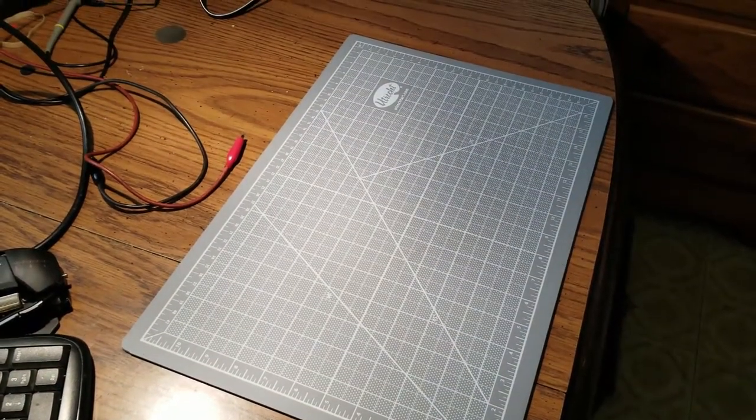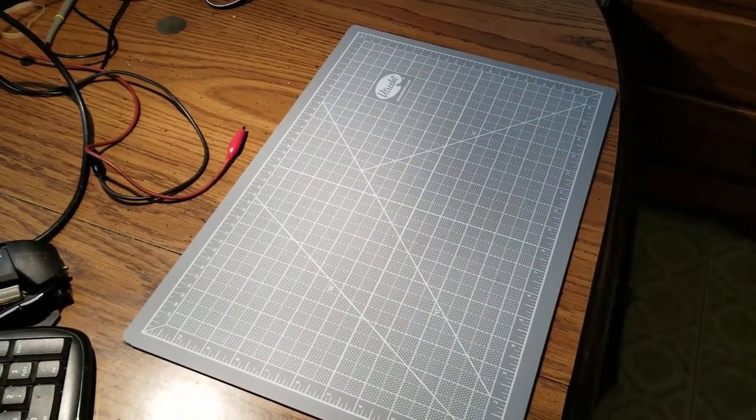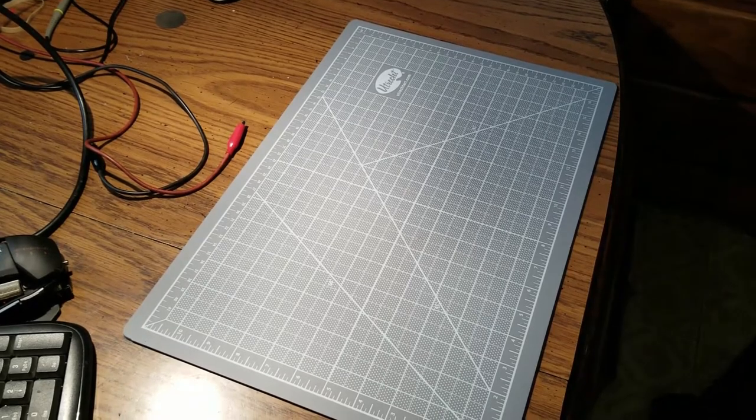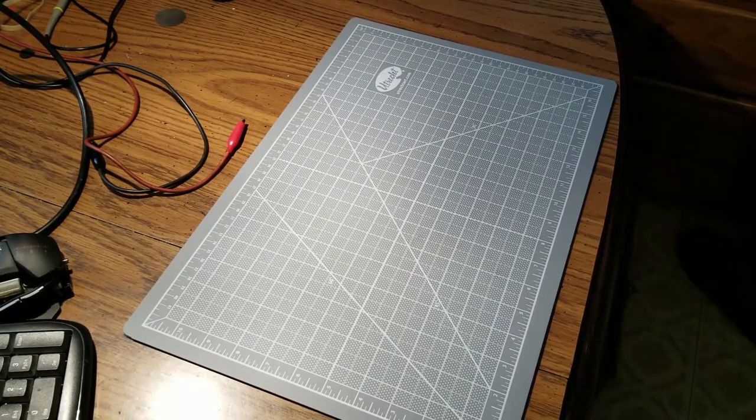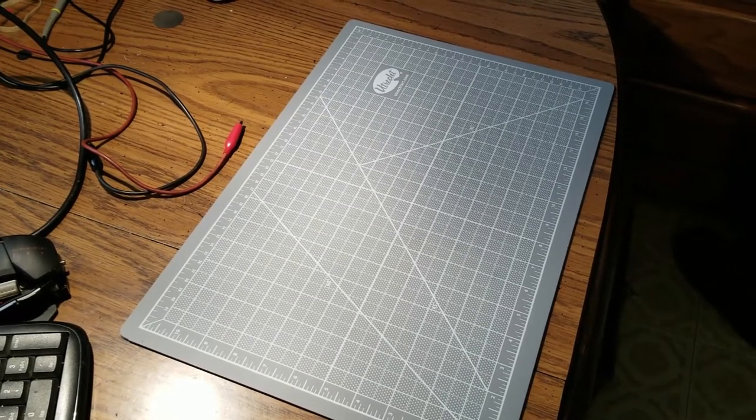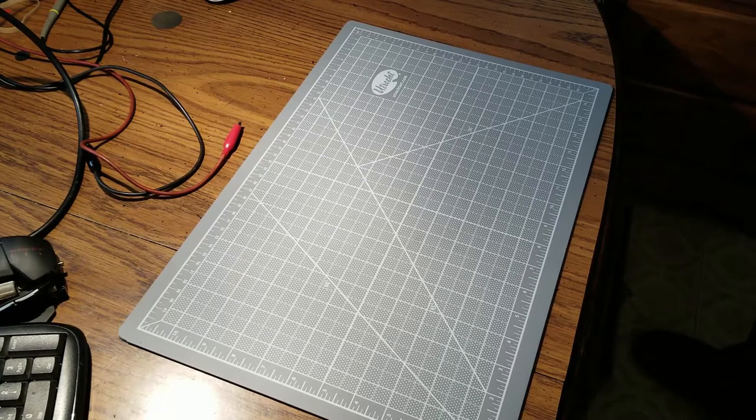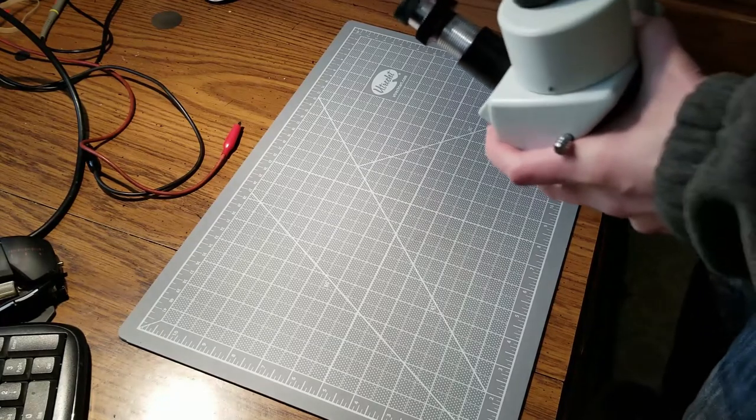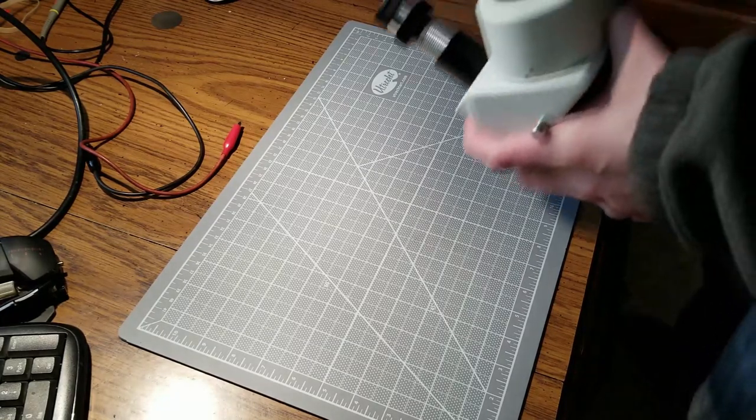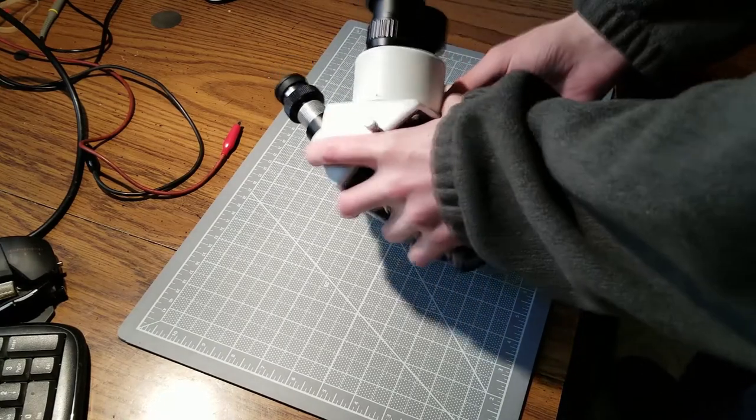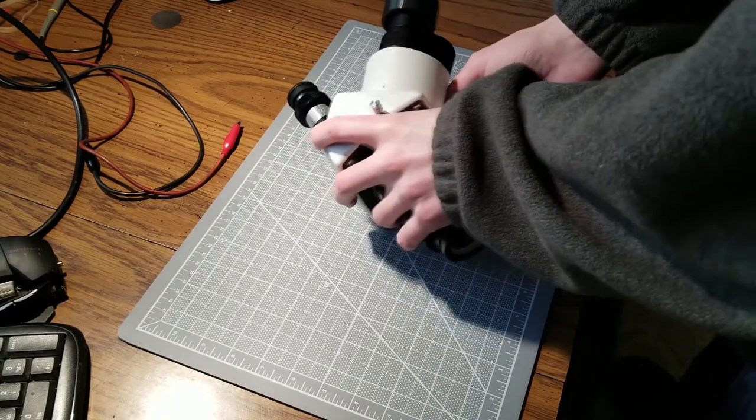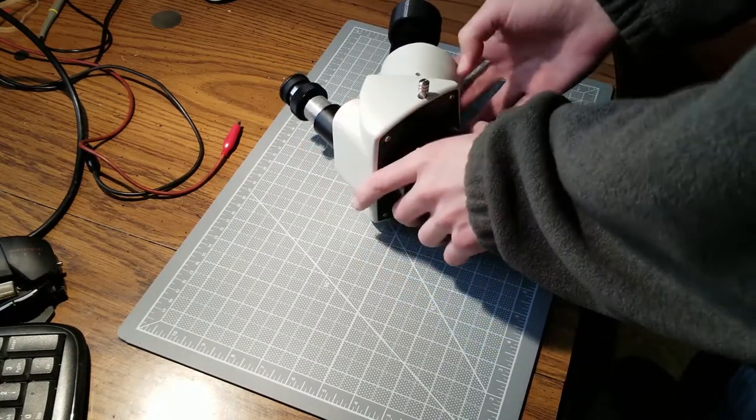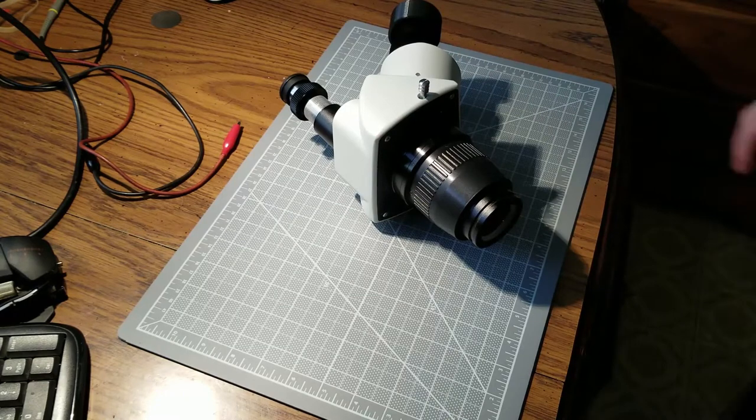Hi. In this video I'll be taking apart my Amscope microscope. From what I've been able to tell, there's no model number on it, but I think they're pretty similar in build type for this general model, so yours may apply if it looks something like this.